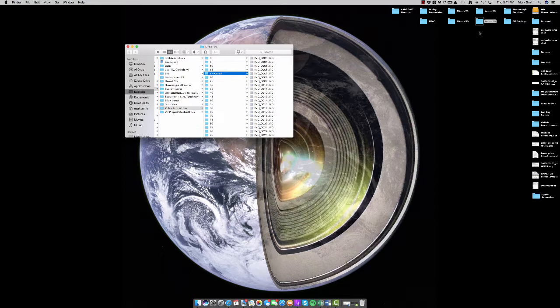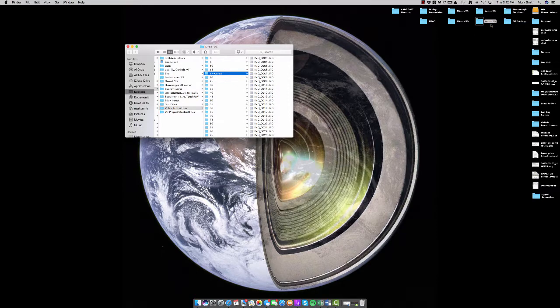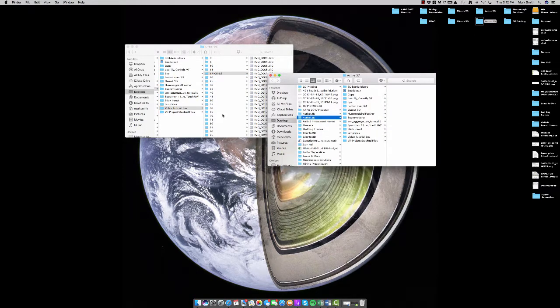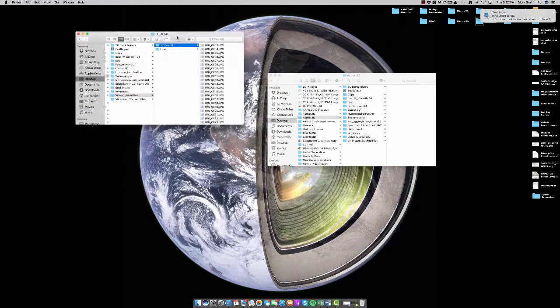First, I want to show you how to do it the tedious way as well. So I'm going to open this folder again, just a second one. If you remember, I had this subset of folders from 0 to 360 in 5-degree intervals, because those are the parameters we used to capture the data. I'm just going to create a new folder called final, and drag all of those folders in there so they're not overlapped with the photographs we took here. There we go. Now I have all my photographs here.